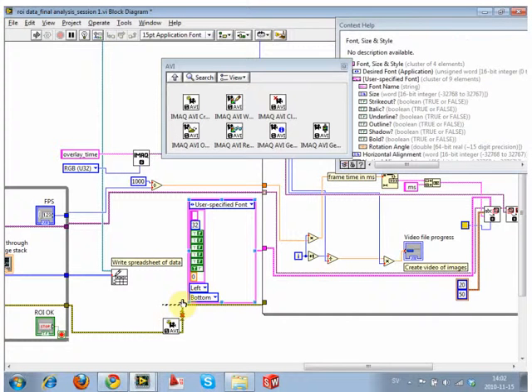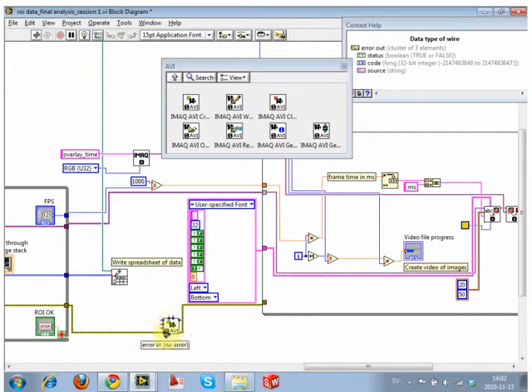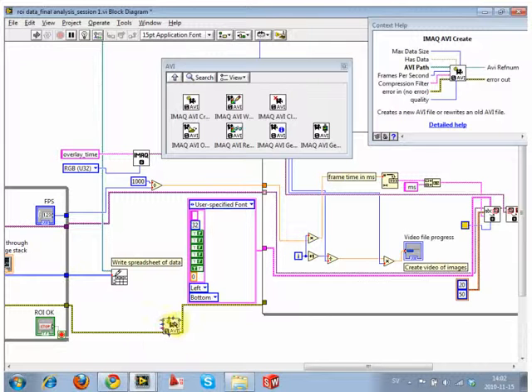Okay. And like before, we have all these choices. For frames per second, we're just going to make it constant. It always defaults to 30. We want to run it at 10 frames per second because it's pretty slow data. What is the quality? The quality is kind of like a compression factor. If you want to run a motion JPEG filter, then there's a quality factor associated with that. Motion JPEG is a good example.